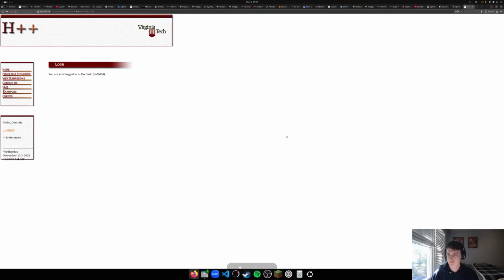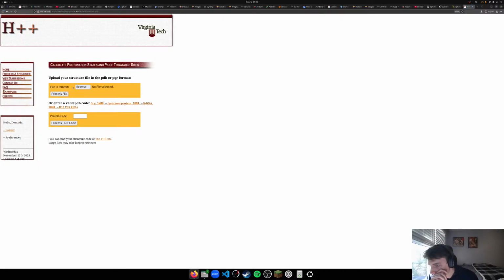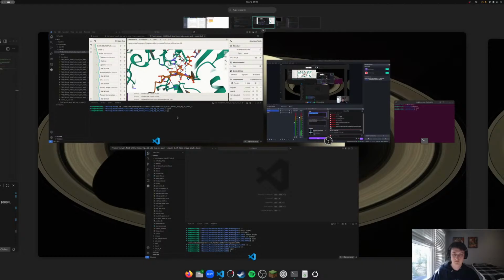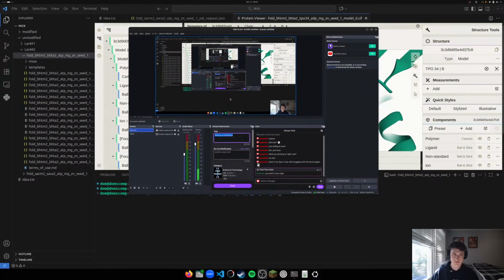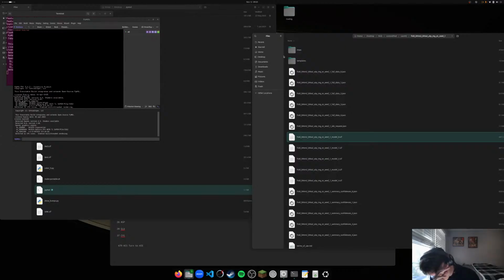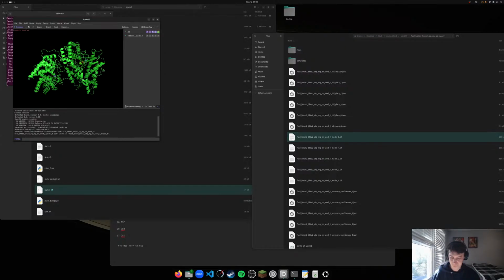Okay, I got it. All right. Process a structure. All right, so we'll do that in a second. I guess this one.